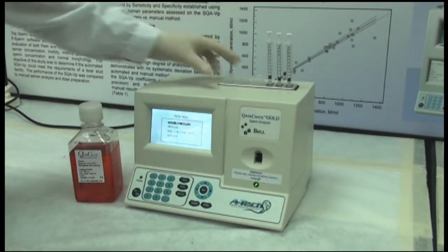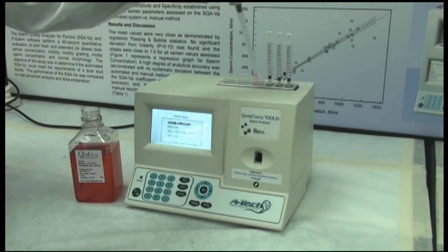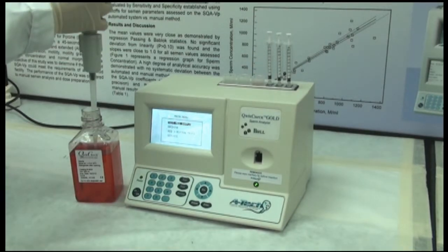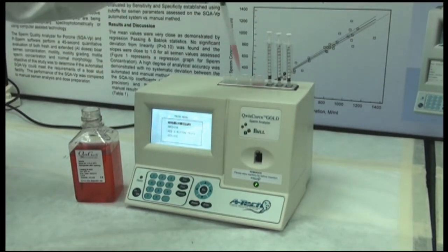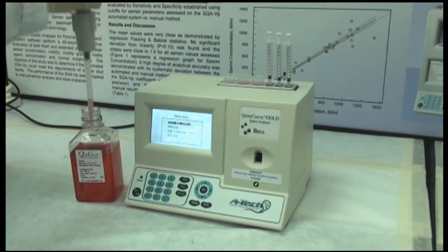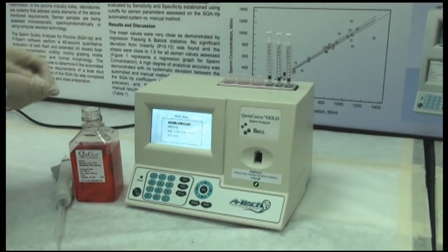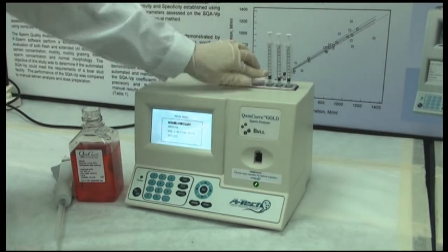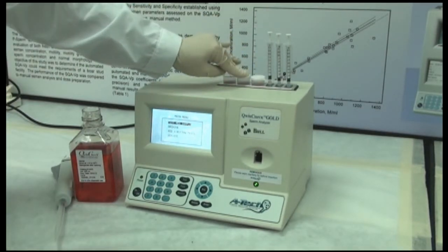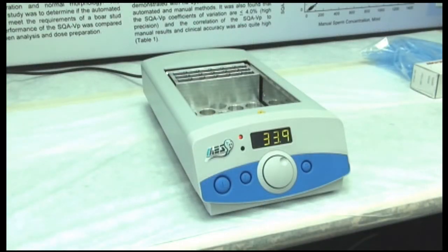Fresh samples require a fixed dilution rate of 2 ml diluent and 100 microliters of sample. Frozen samples require 500 microliters of diluent and 200 microliters of sample. Allow your testing supplies to warm 4 minutes before use. For high-volume facilities, we also offer an external heating dock that can hold 18 samples worth of supplies.